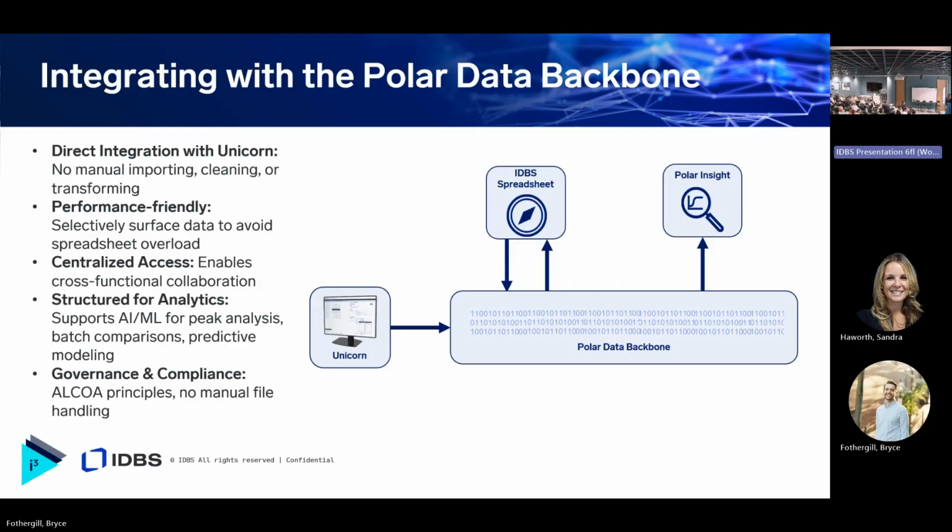And then lastly, but definitely not least, IDBS's bread and butter, governance and compliance. By using Alcoa principles, we want it to be integral. We want the data to make sense. We don't want you to have to worry about what happened in between when I did it in Unicorn and when I'm uploading some file. Who changed what? I don't want to worry with that.